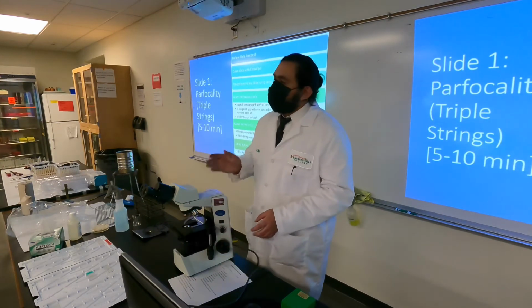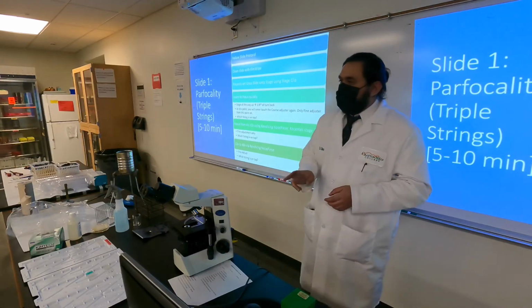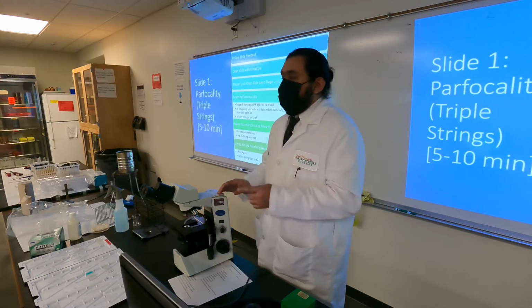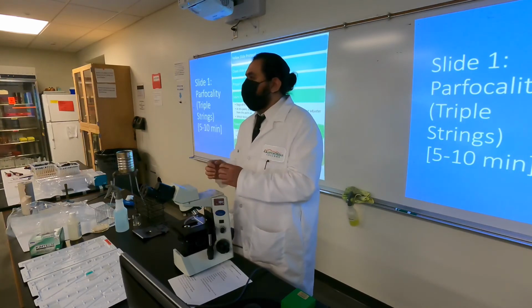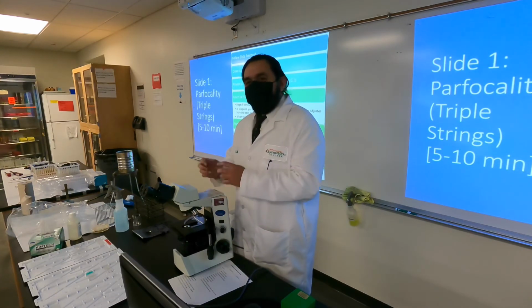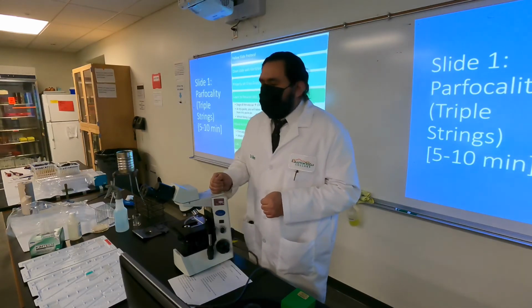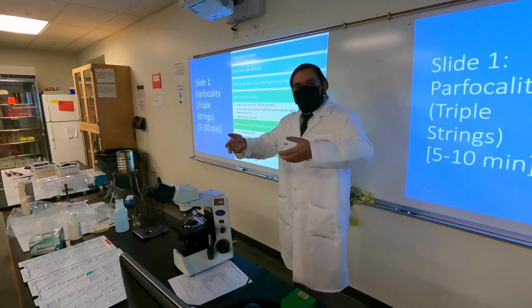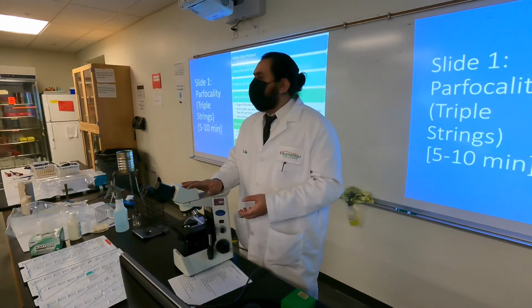Now, in order for this trick to work, in order for parfocality to do its job, you need to do two things. Make sure your slide is always centered, and before you go on to the next step, that it's as sharp as you can get the picture. So make sure you turn your fine adjuster until you get a perfect, nice and crisp look, and make sure it's nice and centered in your field of view. Then go up to the next step. So now, we're going to practice these. That's what we're going to do for the next couple of minutes.